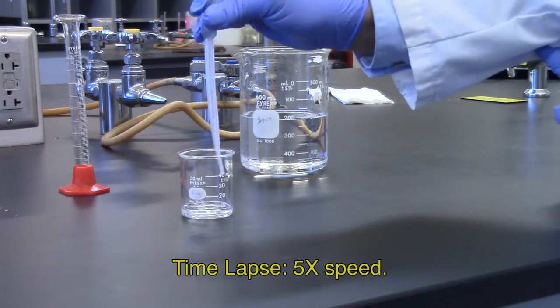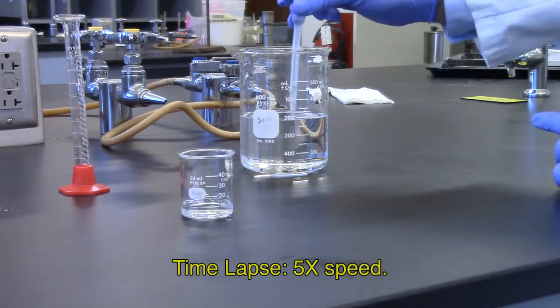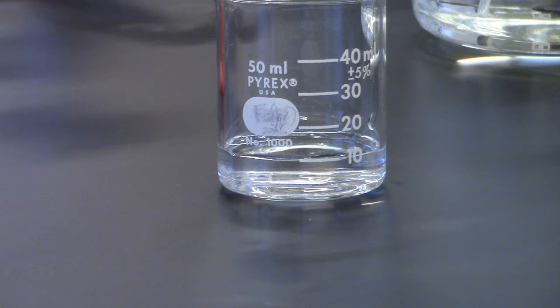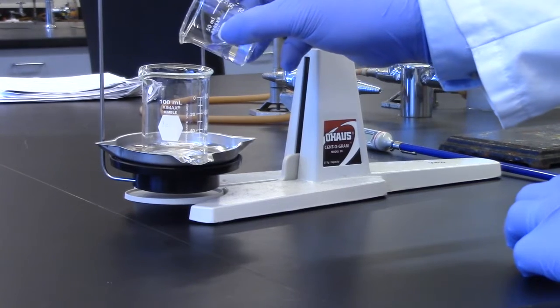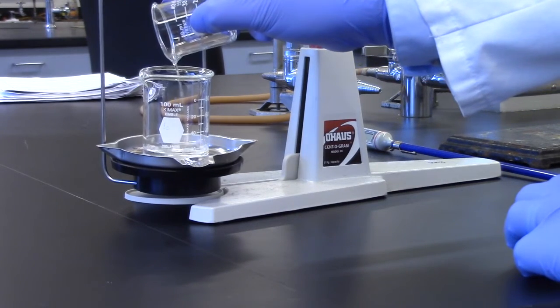Start with the 50 milliliter beaker, pour distilled water to the 10 milliliter mark. Transfer water to 100 milliliter beaker and weigh on the balance.